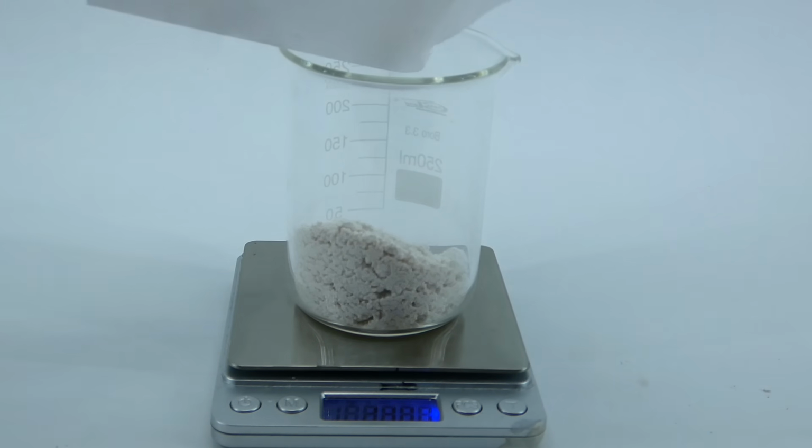After the drying, I had about 16 grams of it, which wasn't a lot, but I still had to process the second batch of the sodium silicate solution, and to do that, I just repeated all of the previous steps.